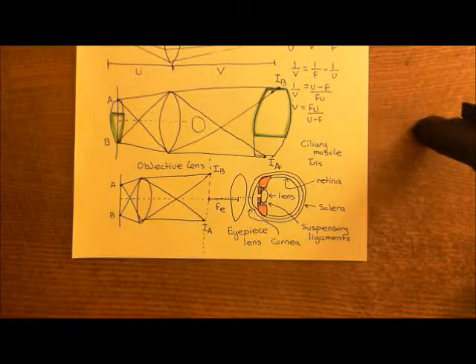Now, why is that such a clever thing to do? Well, what do we know about lenses when you shine light from a point source into them, and that point source is a distance of the focal length? Well, all of the light beams will be focused in parallel lines.